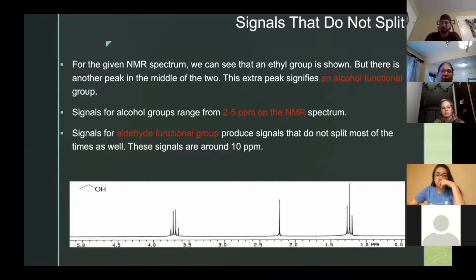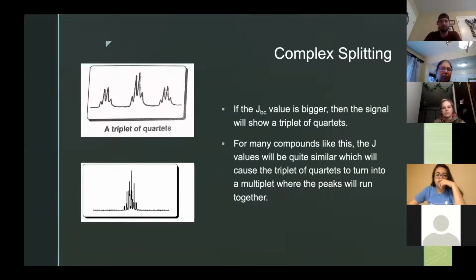Can you go back to the previous slide, please? This one, the complex splitting, you have to know for theoretical purposes. You will not be asked to analyze something like this, but you need to know how complex splitting occurs theoretically. It could be a question on the exam or the quiz.